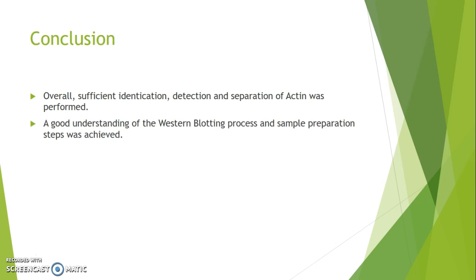Conclusion. Overall, sufficient identification, detection, and separation of actin was performed. A good understanding of Western blotting process and sample preparation steps was achieved.